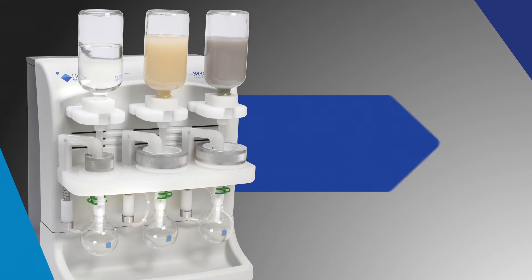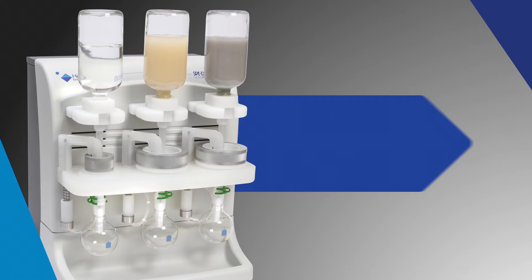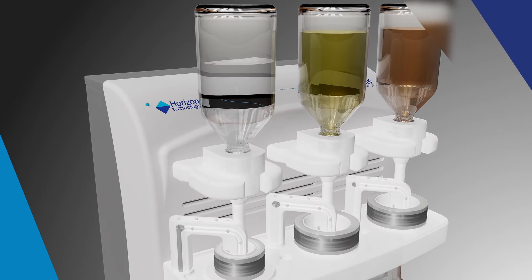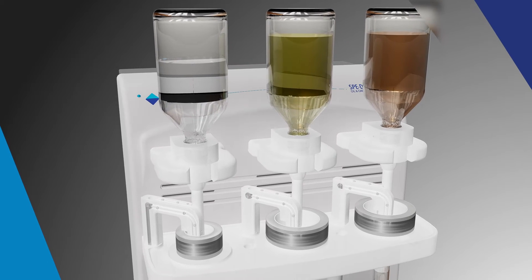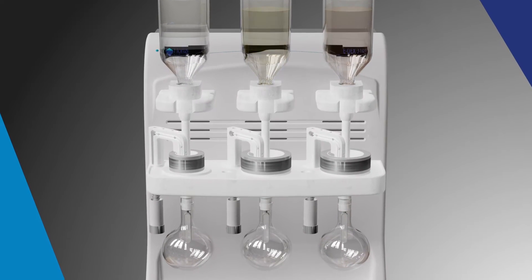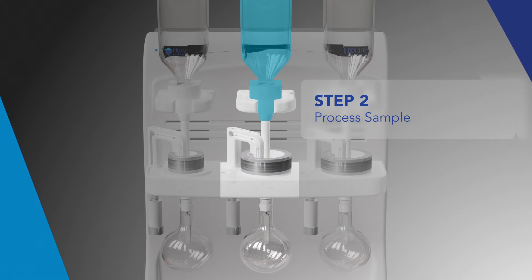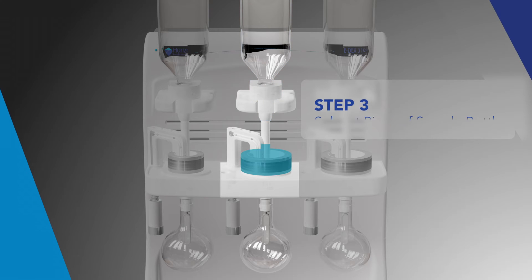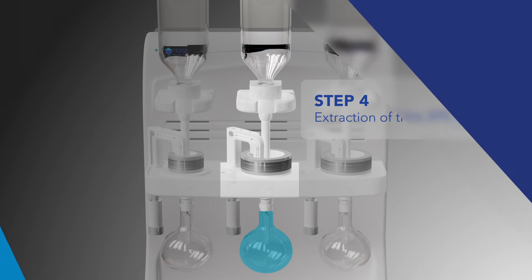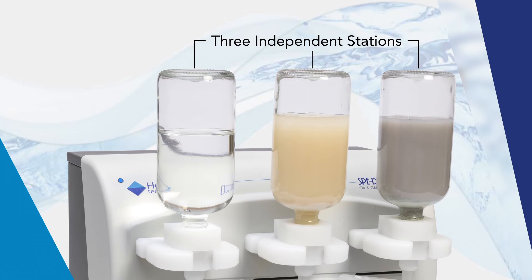The Horizon Technology SpeedX 3100 Oil & Grease Extractor is a modern automated disc SPE system. The system automates the entire extraction process and is fully compliant with regulatory methods. The system operation is shown in steps 1 through 4, showing preparing the disc, processing the sample, rinsing the sample bottle, and elution of the sample.